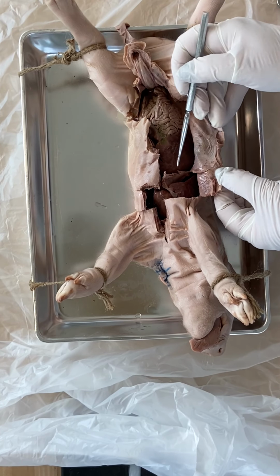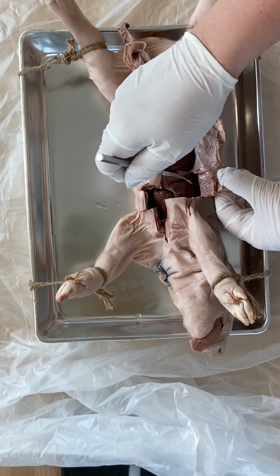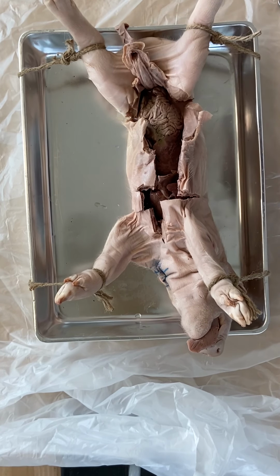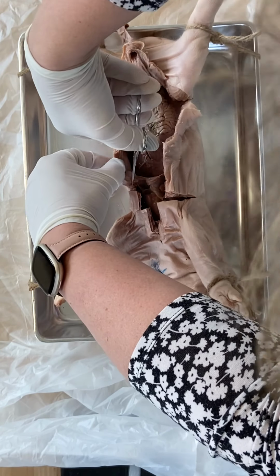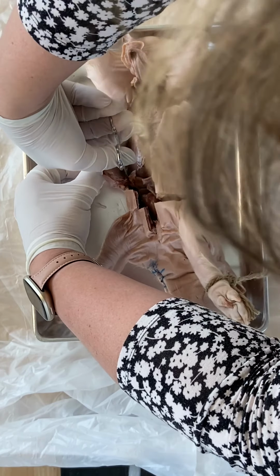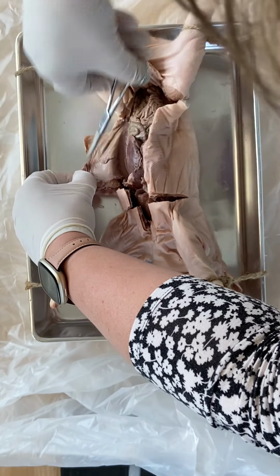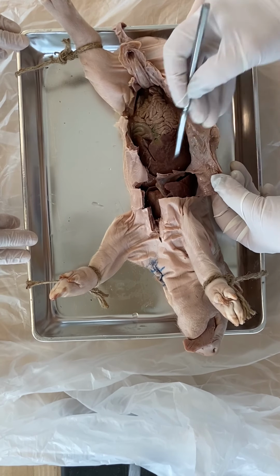Yeah. So here is the diaphragm. You can see where I've cut it because it's attached to here. But you can see there, and it's still attached on this side. Let's see if I can get some on this side. Okay, now we can see some diaphragm quite nicely.